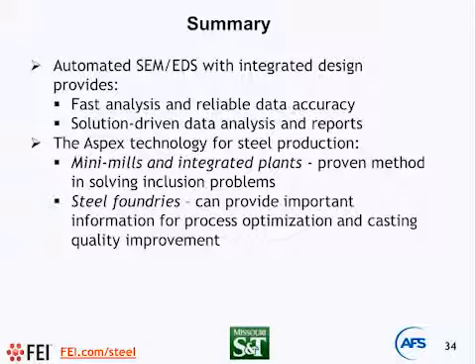But all people are different, and we could say that our analysis was not consistent. But when we have liquid steel, we have good mixing inside it, and typically when we count more than thousands of inclusions, we use a so-called random technique, where we polish a larger area and take inclusions randomly from different areas, which allows us to have a consistent result.